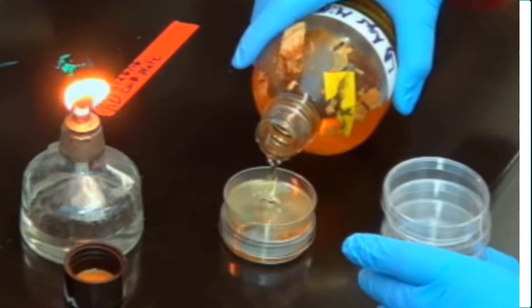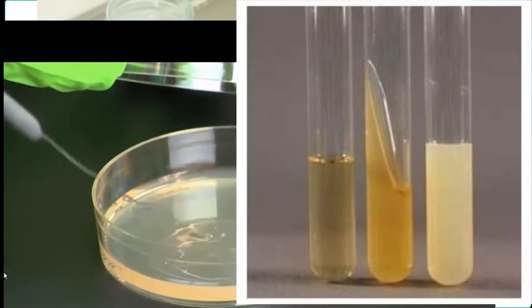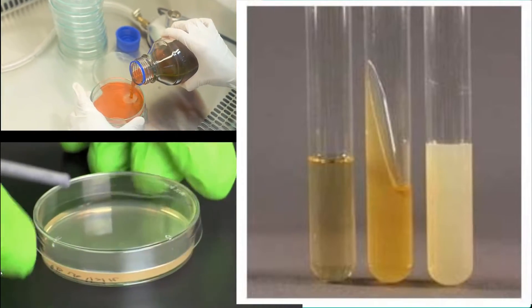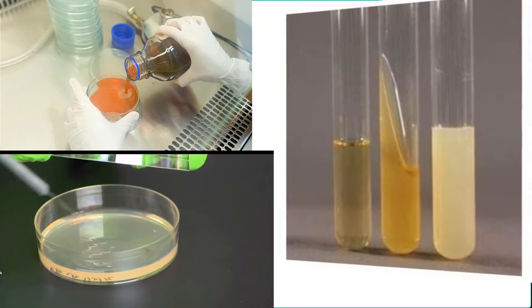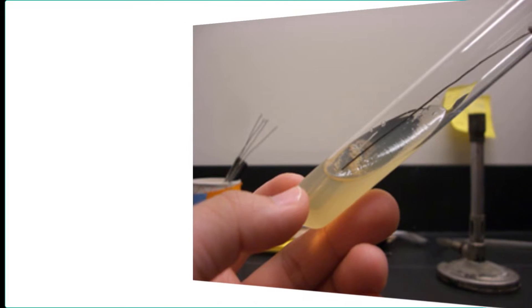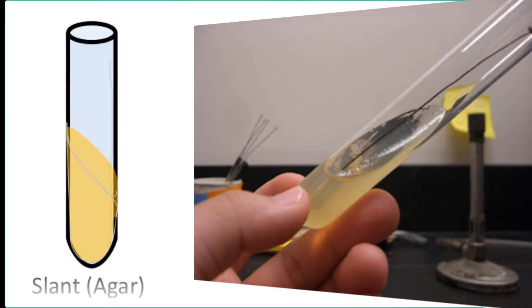Warm agar can be poured into petri dishes to form petri plates or agar plates or poured into test tubes. And you can even keep those test tubes at a slanted angle as it solidifies so that you can get slant tubes or simply slants.